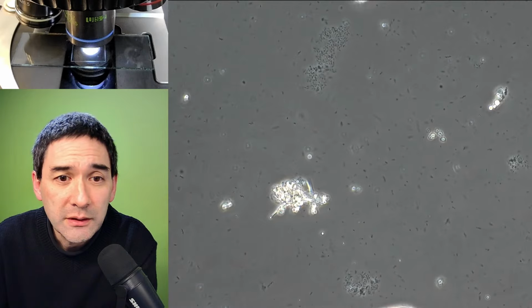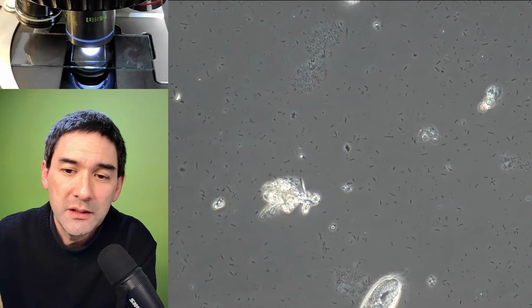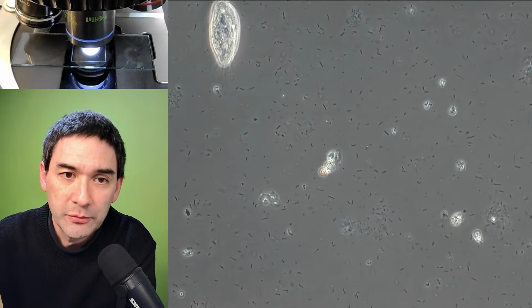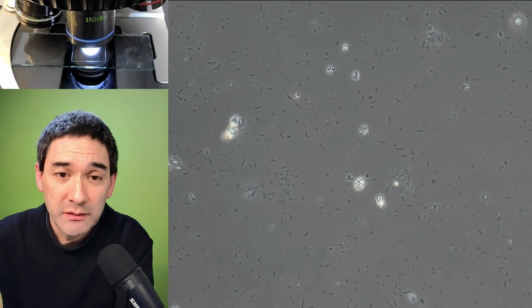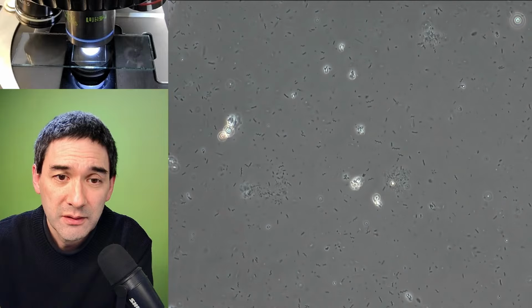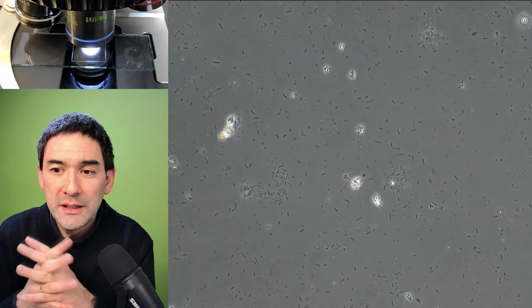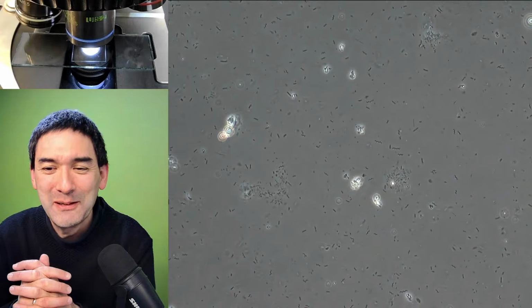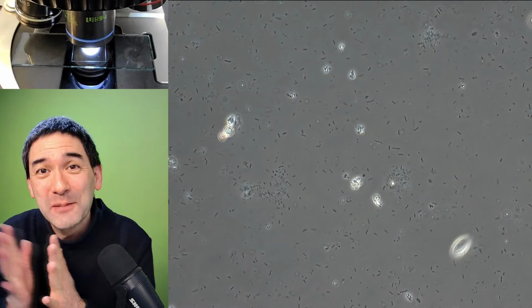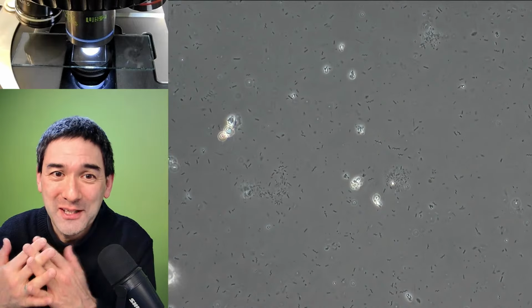Maybe that's the last thing I want to show you: all of those dark dots that you see floating around here in phase contrast are bacteria. So a lot of them, right? That's why you want to be generally careful. Spiral-shaped bacteria even, spirochetes. So you want to observe general hygiene here. I wear gloves when I prepare my slides for moths. I think maybe that's not necessary. We're exposed to microorganisms when we walk on grass or whatever, we're always exposed.